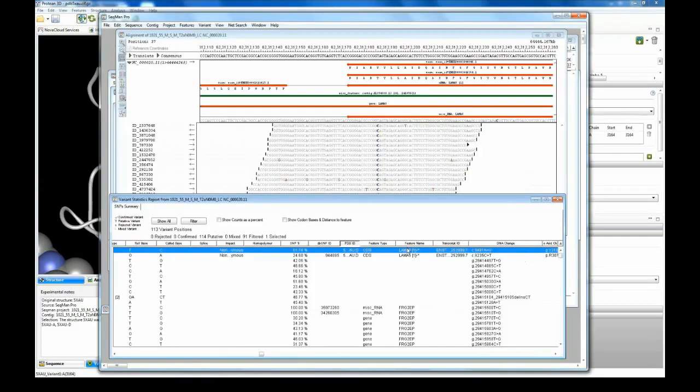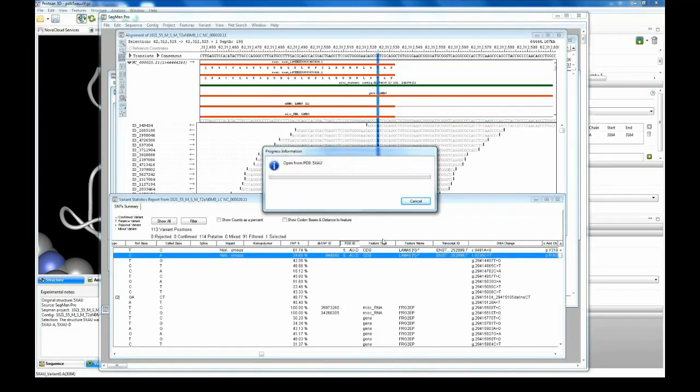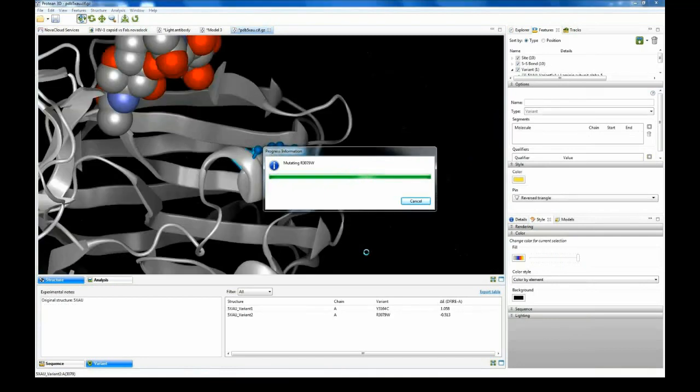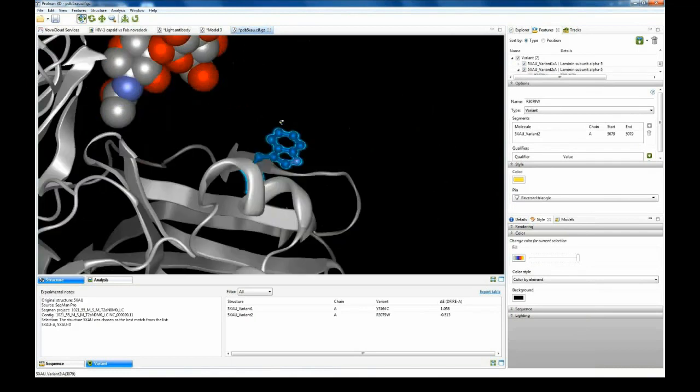Additionally, we can look at this other PDB ID, which is a different variation at a different residue, and then see how the energetics change with the residue variant that we found with the NGS data. And so this one appears to have a negative 0.5.